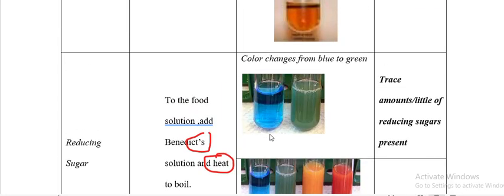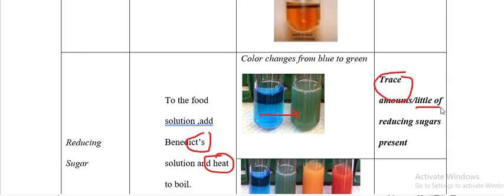The observations for reducing sugars: colour changing from blue to green means trace amounts — or little amounts — of reducing sugars are present. That is when it turns to green colour.